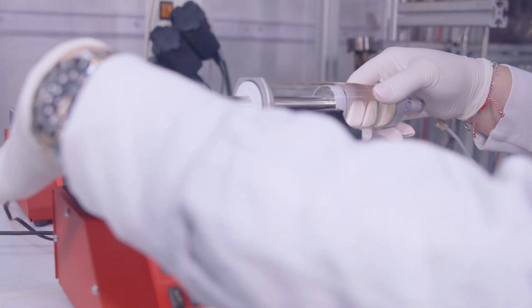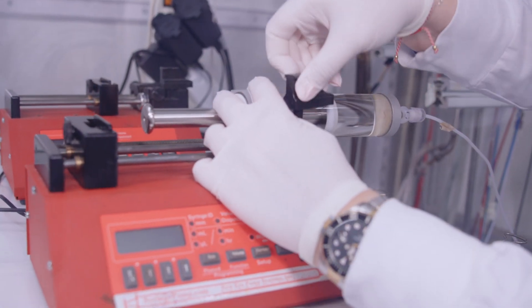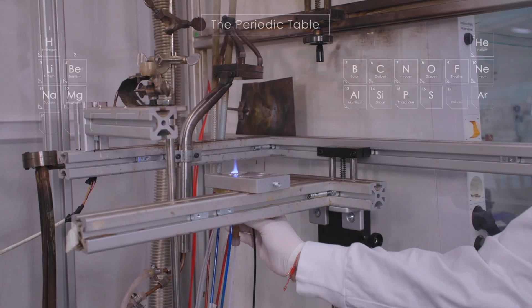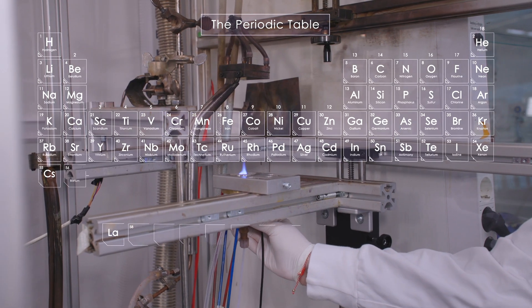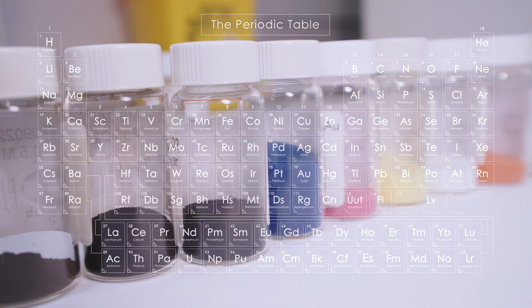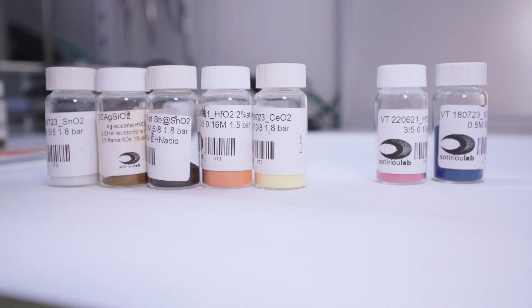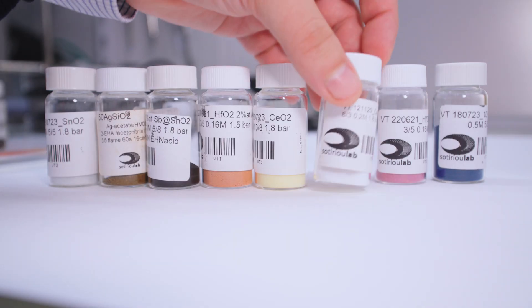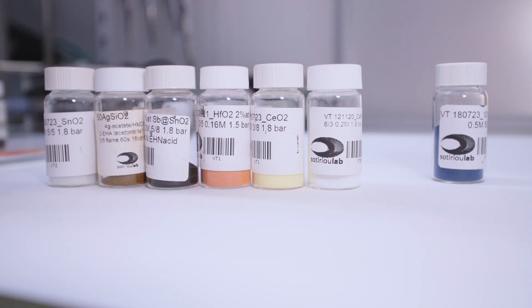Another advantage of this process is that we are very flexible in the composition of our materials. We literally look at the periodic table of elements and we choose the elements that we want to produce, and these particles might have different properties like different color or different chemical properties or electronic properties.